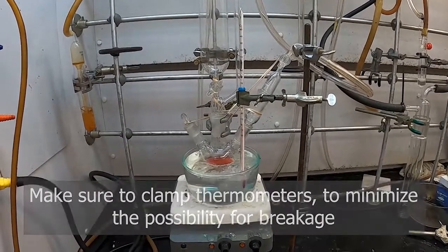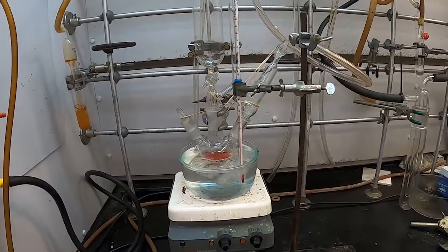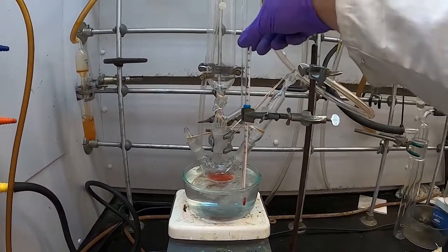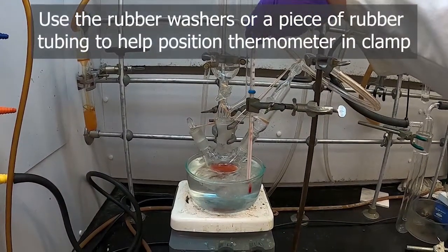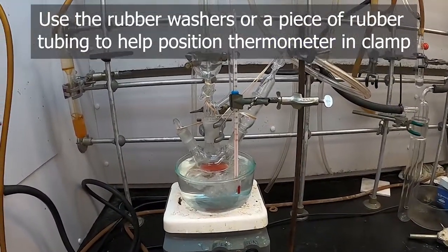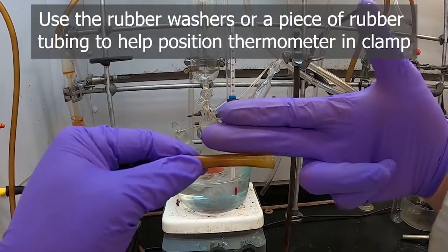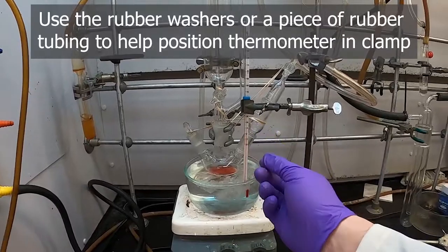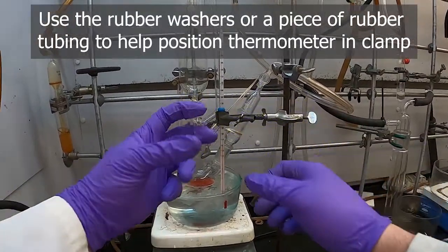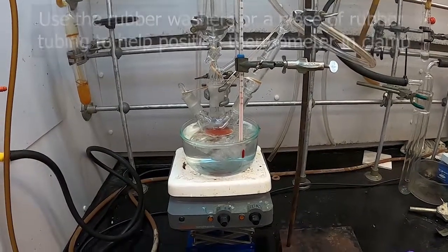I expect that we'll get to about zero or maybe a little bit below. Anyway, thermometers can have these little rubber things on them which are useful for suspending them in clamps. Another way to do that is to take a short piece of tubing and cut it off and then cut it down lengthwise, and then you can wrap it around the thermometer and use it to have a larger diameter for a clamp to grip to, and it will then grip also on the thermometer.